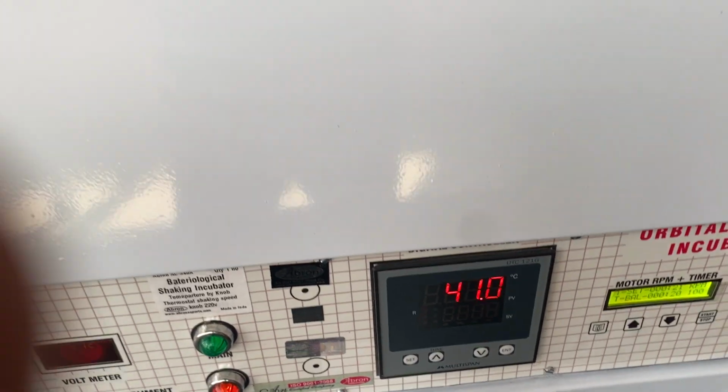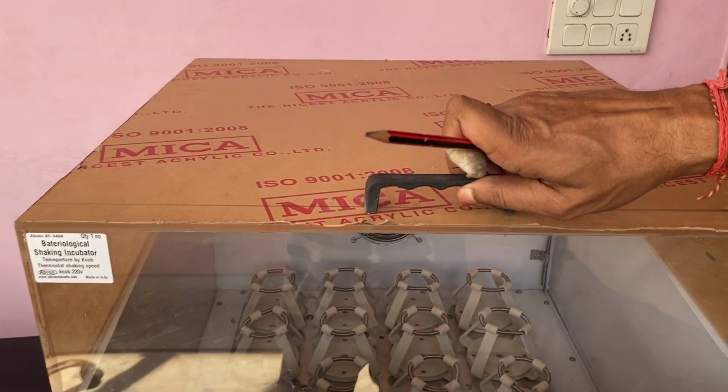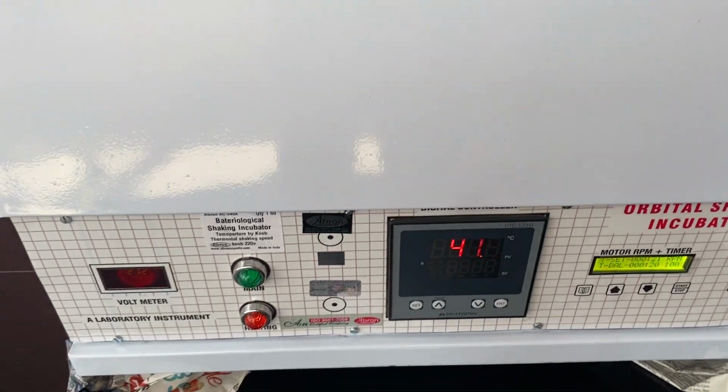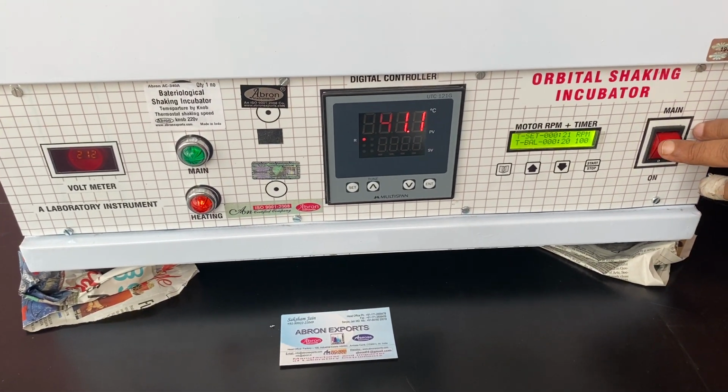Just see, the shaking is going on. Inside you can see the shaking. Here this fan is there on the front side. Shaking is there, and the chamber you can close. This is the shaking incubator, and I can switch it off.